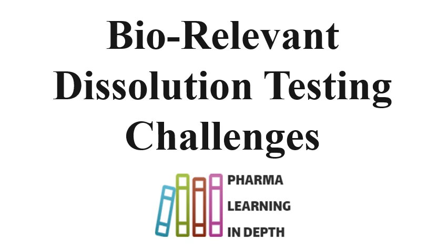There are different types of dissolution testing based on the objective of the test. The dissolution testing may be for discrimination, for batch release, or to show the equivalency of dissolution or drug release between different formulations for dissolution profile comparison, and also to have an understanding about the product behavior in vivo.